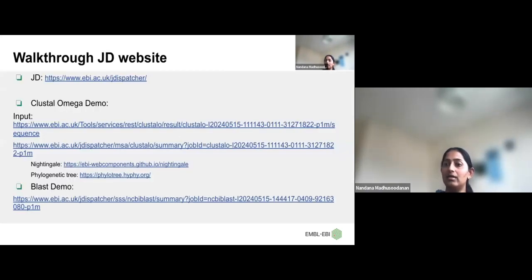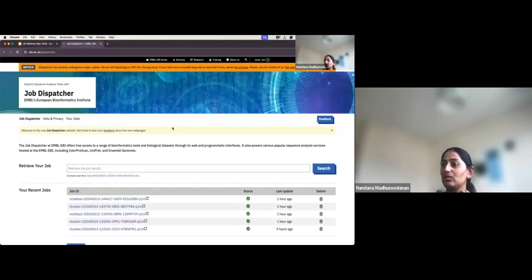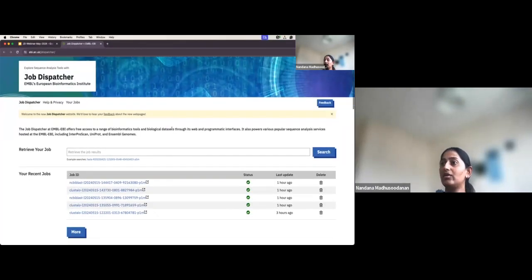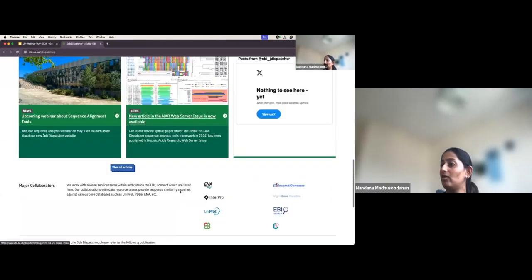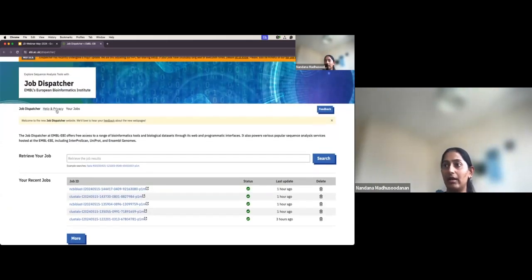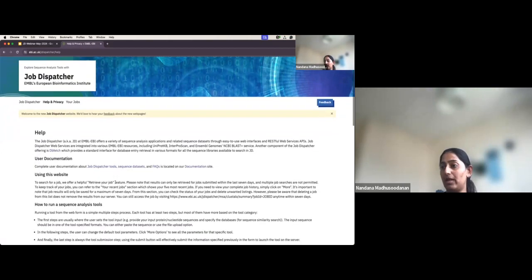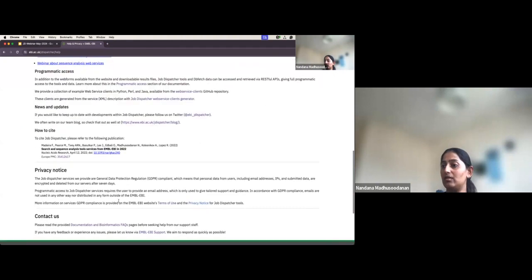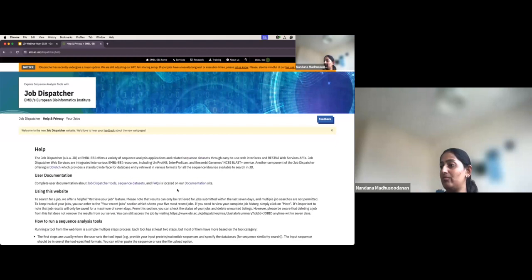Okay, now let me take you to the Job Dispatcher website. So this is how our new website looks. We have already covered these parts. Here you can see help and privacy, which briefly explains who we are and how to get help.